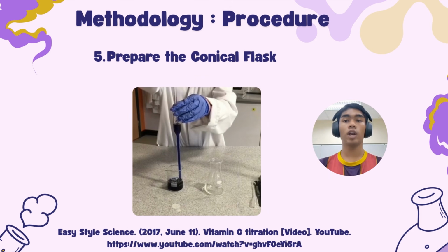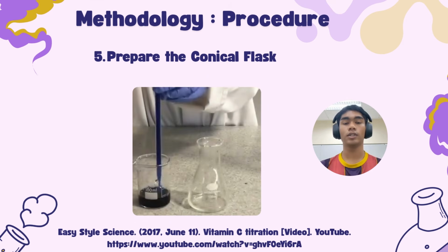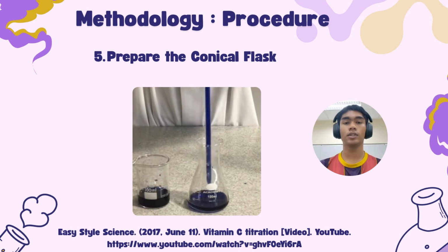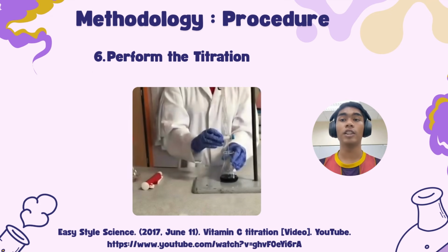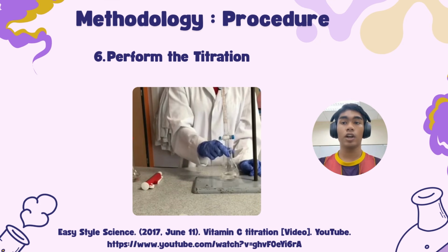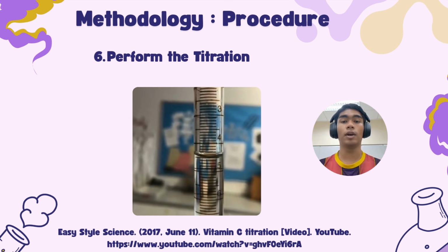Afterward, we need to prepare the conical flask. We need to pipette 25 ml of the prepared DCPIP solution into the 100 ml conical flask. Lastly, we need to perform the titration. Slowly add the vitamin C solution from the burette into the conical flask containing the DCPIP. Continue adding the solution and swirling the flask until the deep blue color of the DCPIP disappears and the solution becomes colorless. The last step is to record your result.